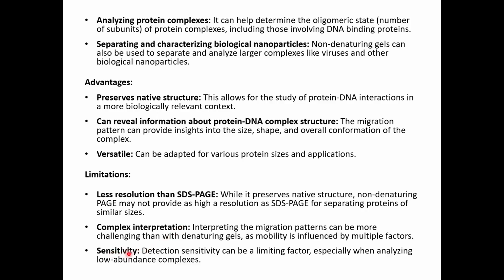Then sensitivity. The detection sensitivity can be a limiting factor, especially when analyzing low abundance complexes. So if you have less abundance of your complex, your detection might not be there because it's not very sensitive. So this is another limitation of non-denaturing gel.